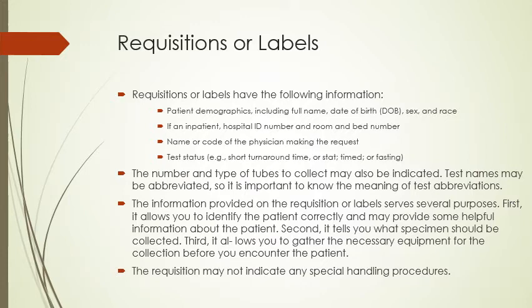However, it may not tell us any special handling procedures, so it's important that we check what the tests require and make sure we understand if it has to be handled a specific way.